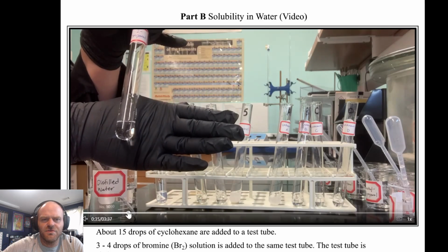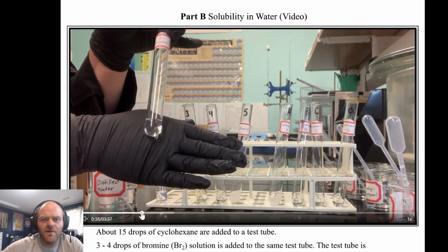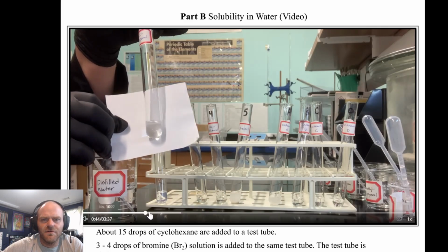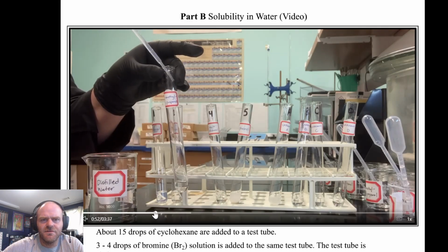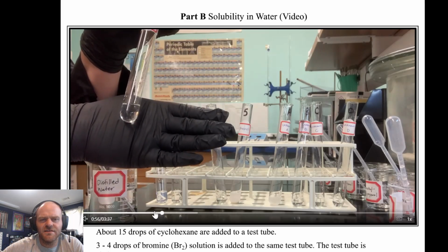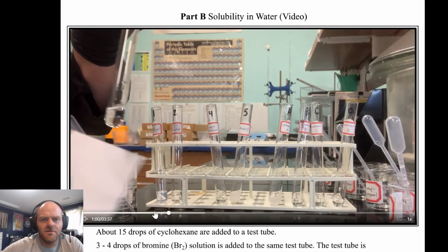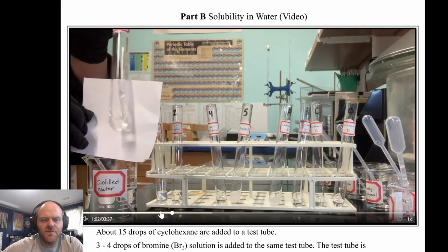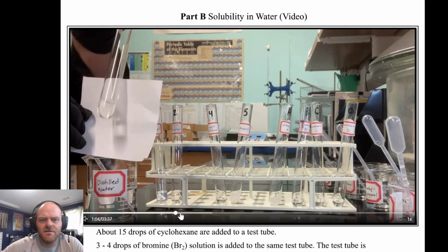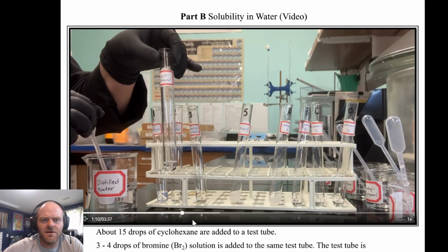This is number 2. All right, so make notes in your report about that one. Still number 2. All right, here is number 3. This is 2-methyl 2-propanol. All right, so make your notes about that. Here is cyclohexanol.